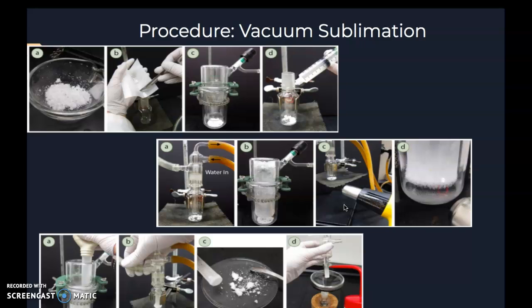Once your crystals are onto the watch glass or inside of the beaker, you can place this inside of your drawer and keep it until the next lab.